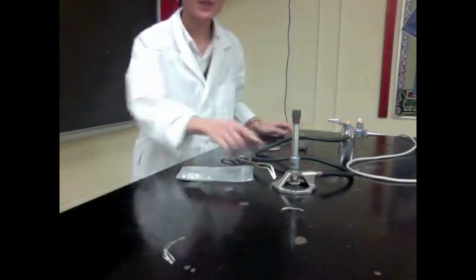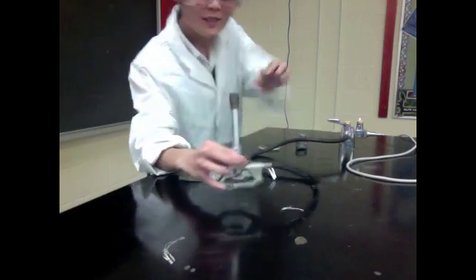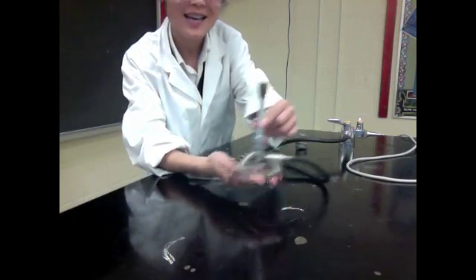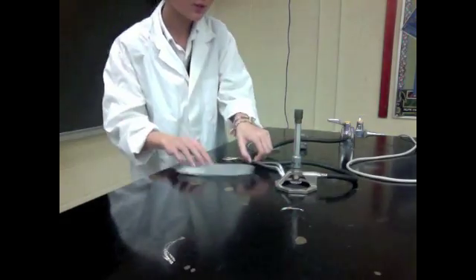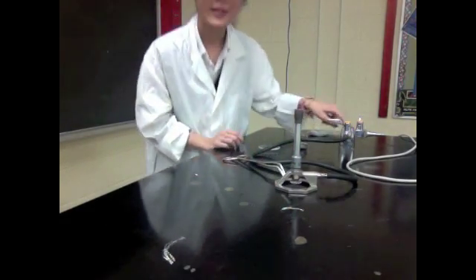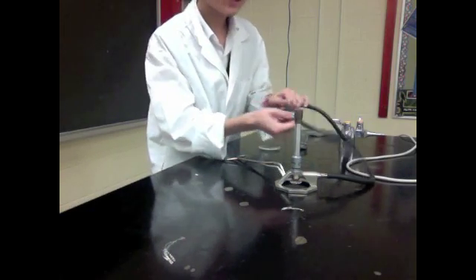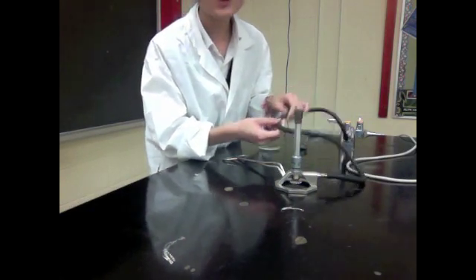We're also going to need a Bunsen burner, which looks like this. And the Bunsen burner is going to be connected to the gas valve here. Now, as you can tell, it's connected by a piece of rubber tubing.